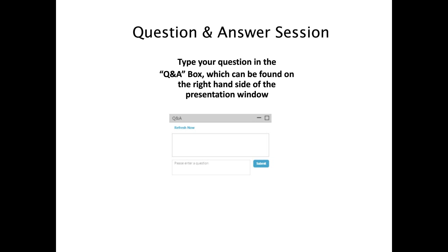Excellent, thank you. What if the selectivity is different on the corresponding Halo column compared to the one I try to transfer a method from? Okay, so if the selectivity is different, you might see an improvement in the separation, or you might need to slightly adjust your experimental conditions, including the mobile phase composition and temperature, to achieve comparable selectivity with the Halo column. So here's another one.